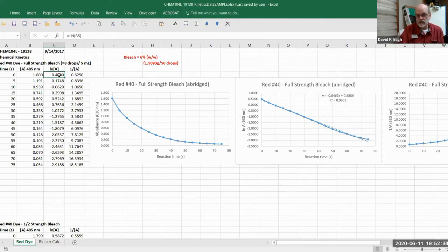Right? So once you've got that one input, then the rest of them are already there now, but for you to do it, just go to the lower right-hand corner of that cell and grab that handle, click, hold, and drag it down. And it fills all the other cells with the natural log of the relative cell to the one that you're referencing here.